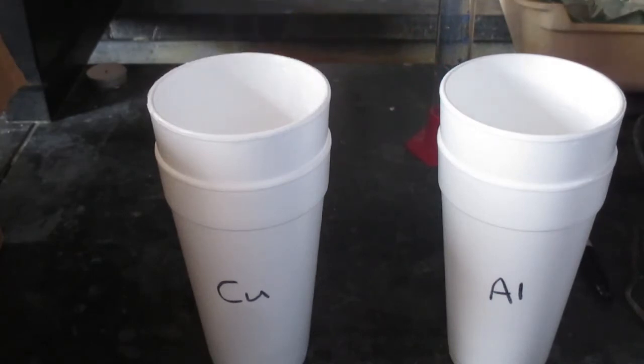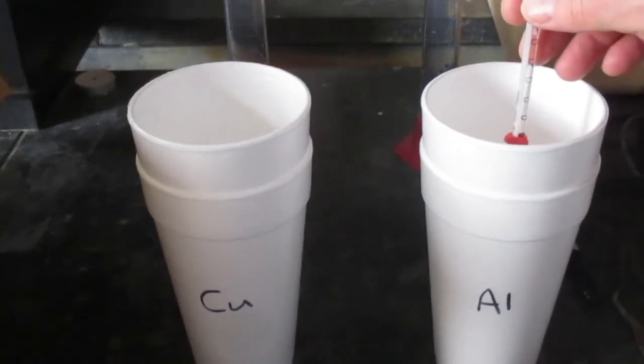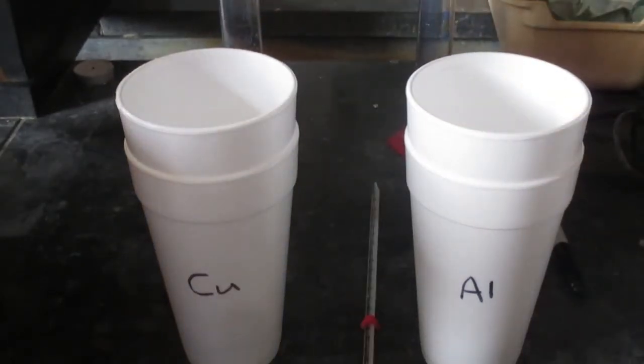The nested calorimeters are labeled accordingly. I'll let the distilled water sit in the cups for 15 minutes, then record the temperature of the distilled water prior to placing the cylinders in. The temperature of the water for the aluminum is 17 degrees Celsius, and the temperature of the water for the copper is also 17 degrees Celsius.